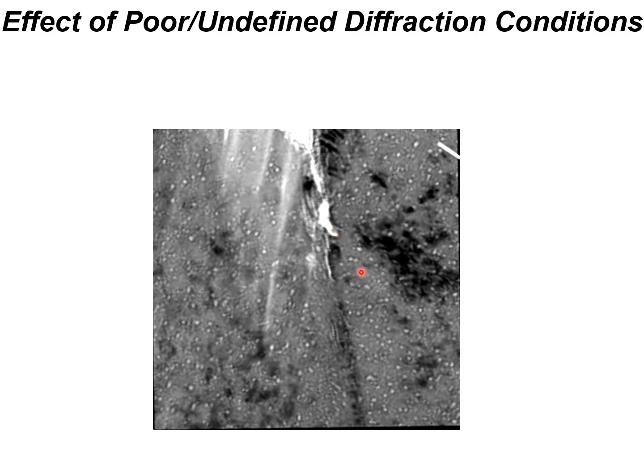And being in the audience, I said, well, what is that? I see something. It's not clearly in contrast. So you haven't tilted it to the right conditions for giving the right diffraction contours to know what it is. And the guy just said, oh, it's a slip band. And I'm thinking, oh, that doesn't make sense at all. Because anyway, it just didn't make sense.